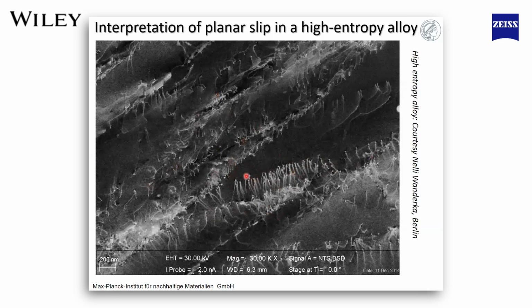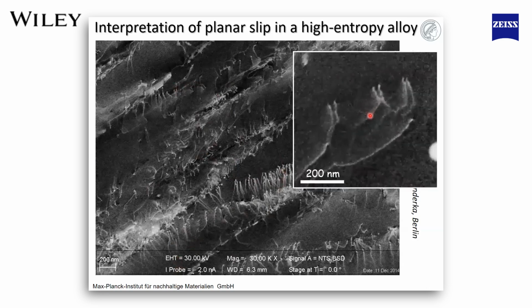And we see something more in this picture. We see here and here and here and at many other places that the dislocations are paired. So I just zoom in. You always see dislocations are paired. And this tells us something about the behavior of this material. It could be, for example, that I see a dipole following each other, so a plus and a minus dislocation, or two positive dislocations running one after the other.